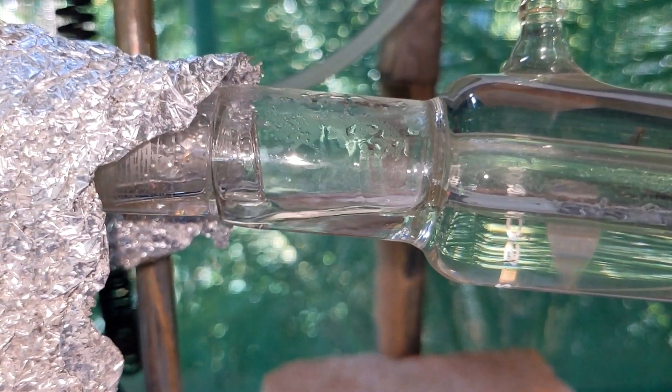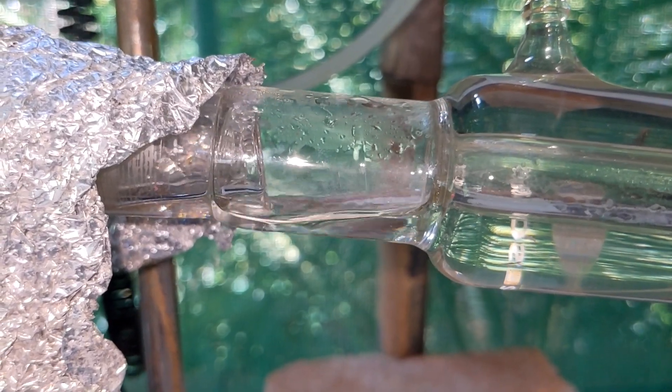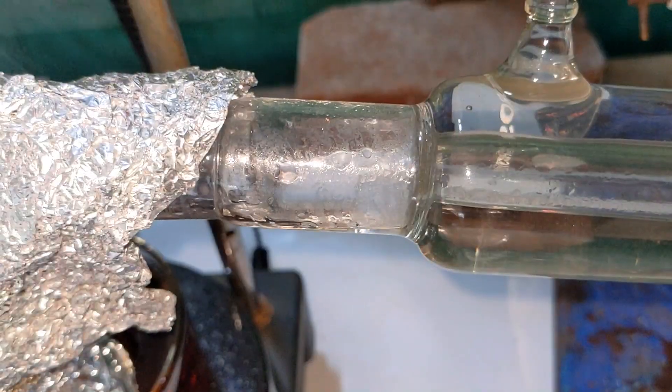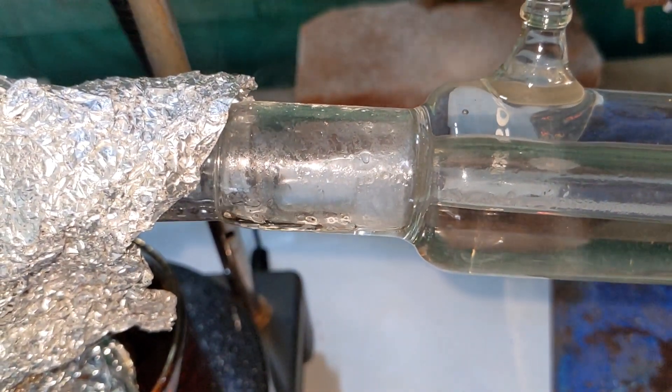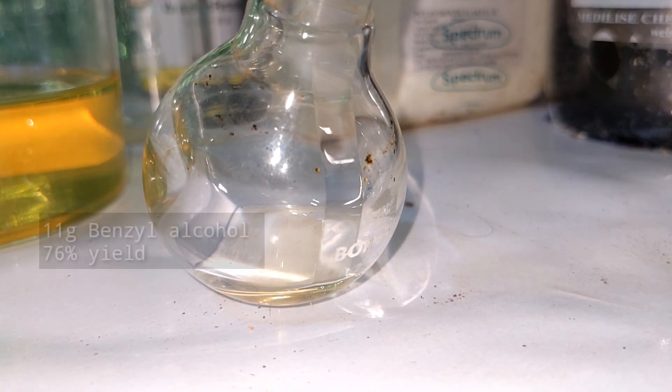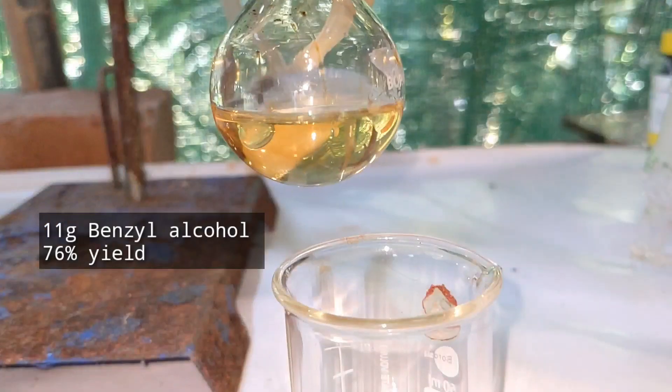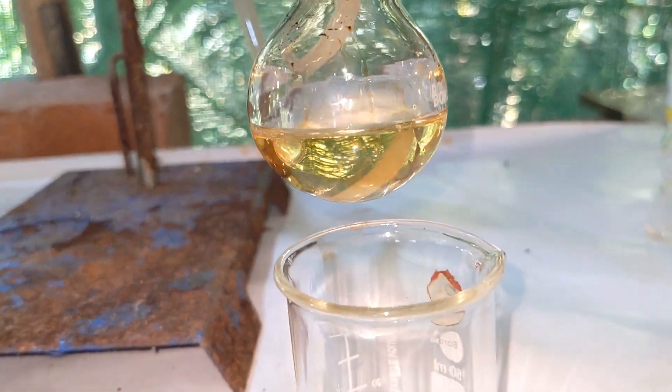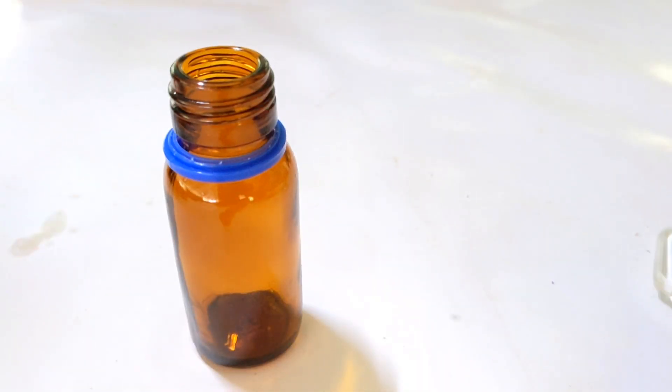Unfortunately my receiving flask contains some organic dye stain and the liquid attained a faint yellow color in the receiving flask. But that is not going to be an issue for me. I obtained 11 grams of benzyl alcohol which represents 76% yield. Then I poured it into an amber glass bottle for storage.